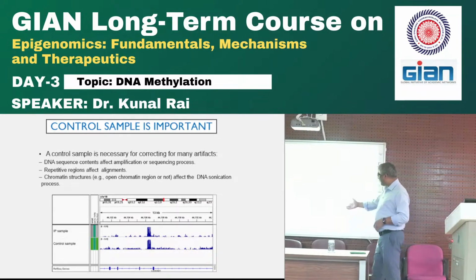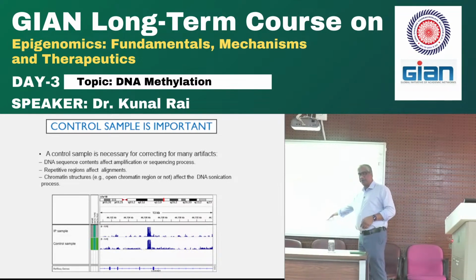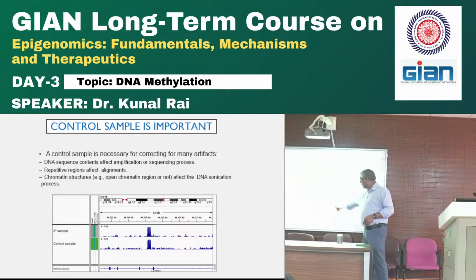So this is real stuff. A lot of times you'll get things in your control like this. If you didn't do a control, you'd call it a peak. But if you did the control, you won't call it a peak.